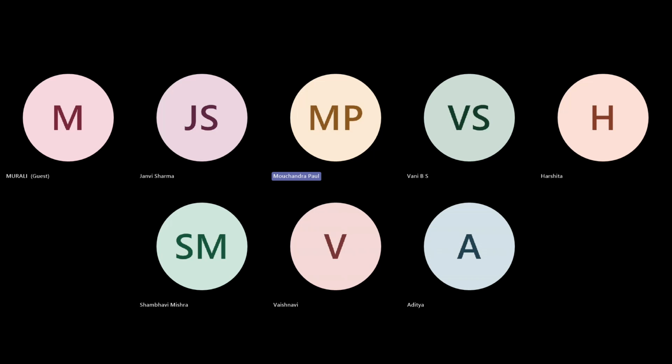So in a hemocytometer, the accuracy of the number of cells depends on the person who is counting, because you're manually going to count the cells under a microscope. So you use a hemocytometer device that looks like this. This is a device.